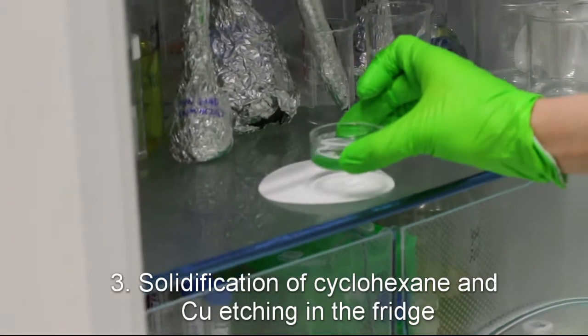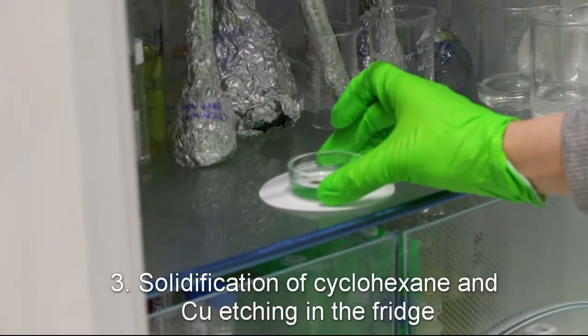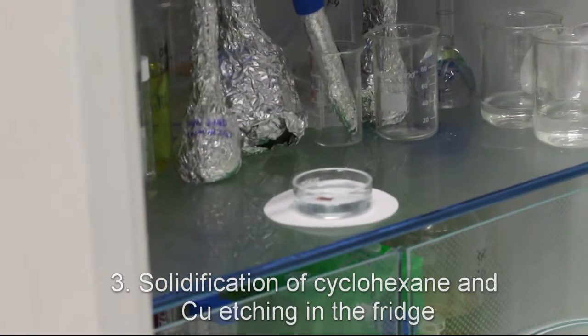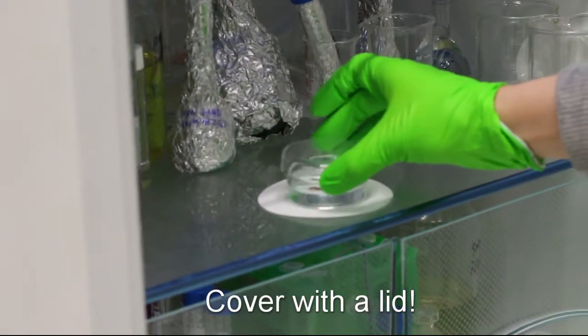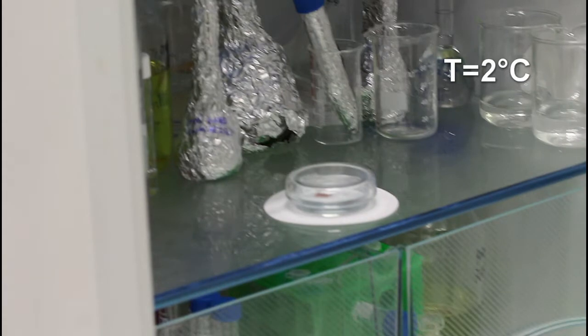For the next step, we put the sample in the fridge at 2 degrees Celsius and cover it with a lid because cyclohexane is very volatile. Melting point of cyclohexane is 7 degrees and of water is zero, so at 2 degrees cyclohexane freezes and water stays liquid.